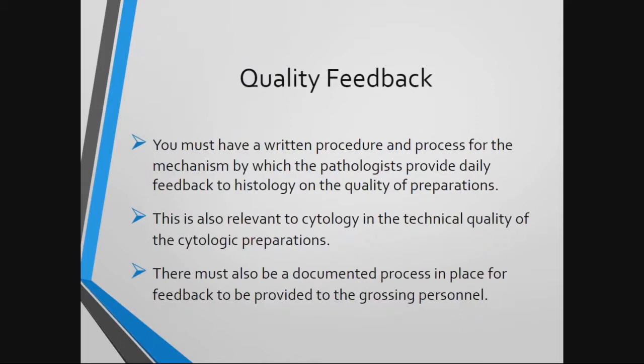Quality feedback is essential for quality improvement in the histology and cytology laboratories. There must be documentation that a process is in place for pathologists to give feedback to the histology department for the technical work being performed. This could include anything from processing, including decals, your cutting and your embedding, to your H&E staining, IHC, special stains, the whole gamut. Documentation should be present demonstrating the assessment also of cytologic preparations in the same capacity. This is particularly important when you have cytology prep techs who perform all processing.